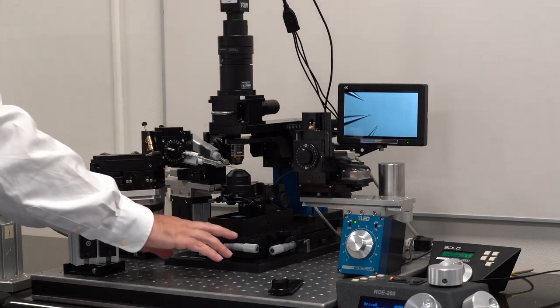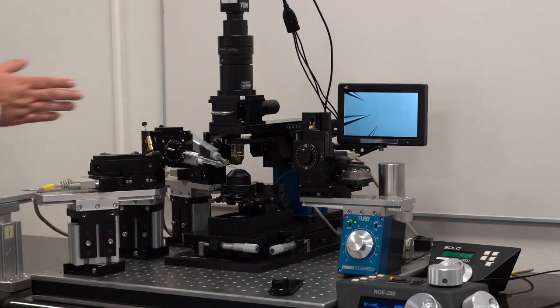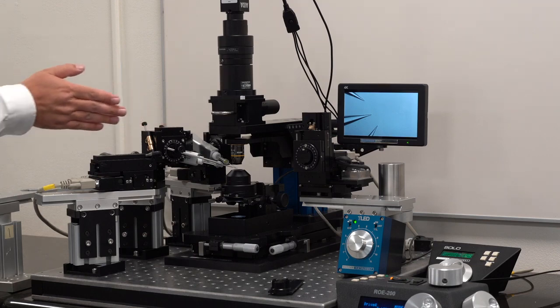It is mounted on a manual translator. These are our newer manipulators in a narrow format 865 that my colleague Ali is going to talk about.